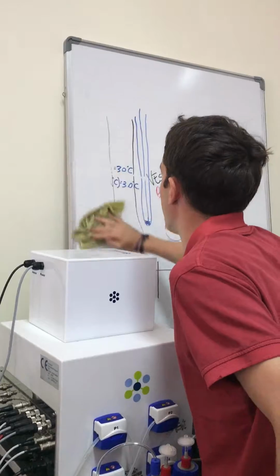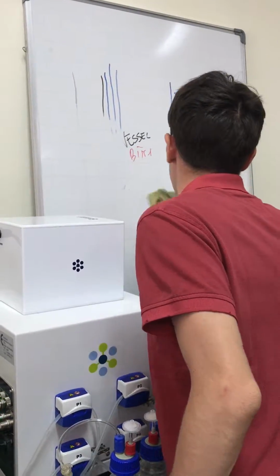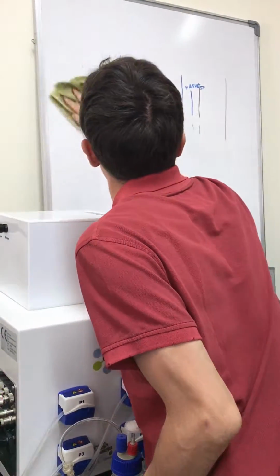No. Okay. It's a little bit difficult, but I will explain to you. It's very flexible because you can manage the strength of the thermoregulation and of the pH regulation.